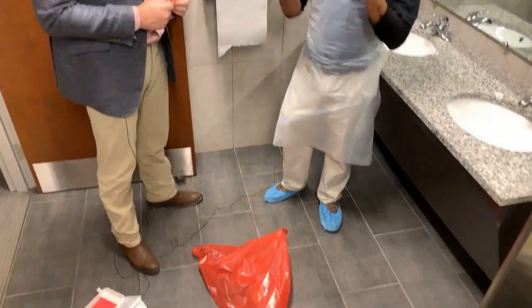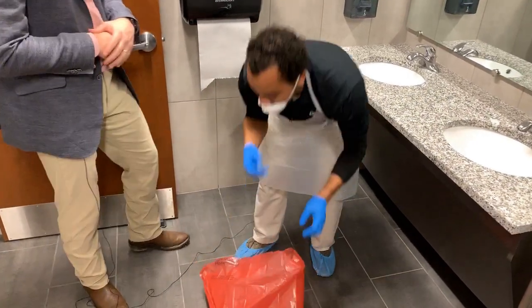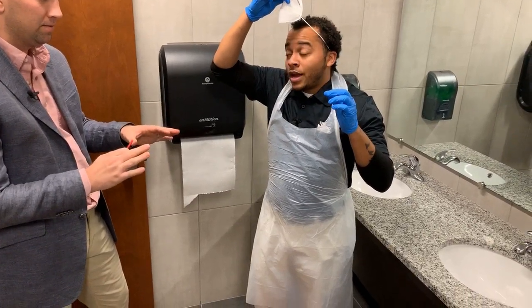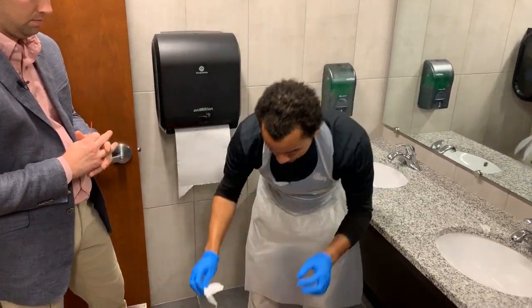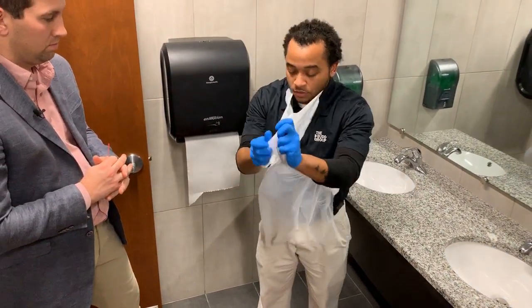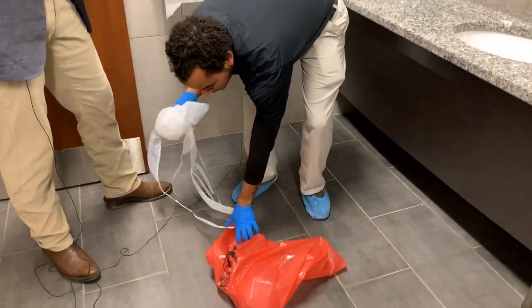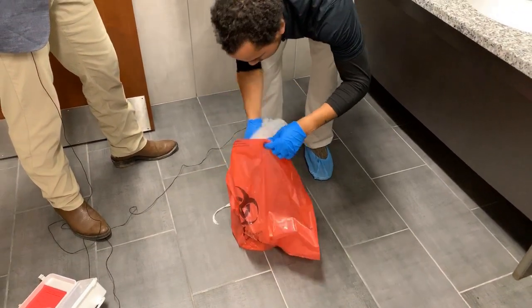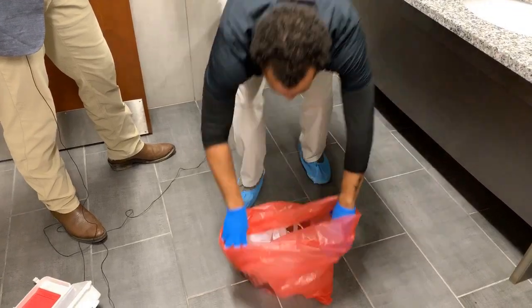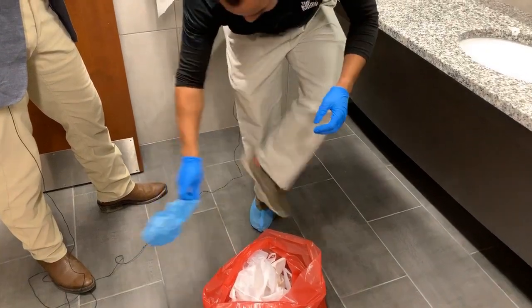Okay? So I'm going to start with my goggles first. And then I'm going to take off my face mask. Now it's important not to touch your face, right? Not to touch your face at all. Then my smock. And then my booties.